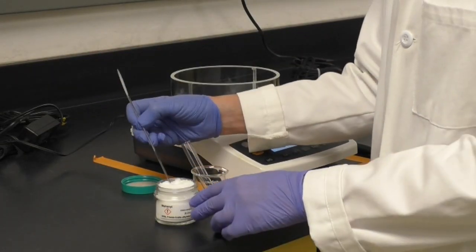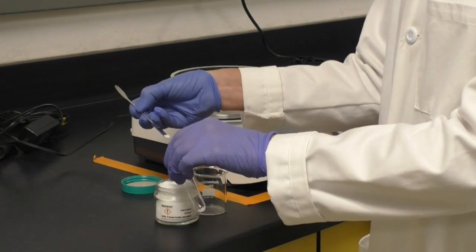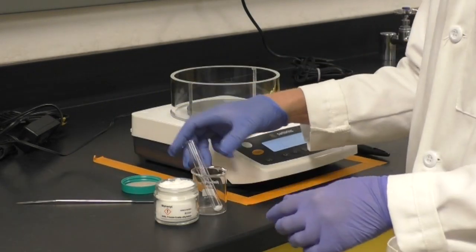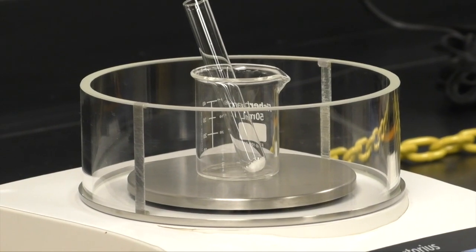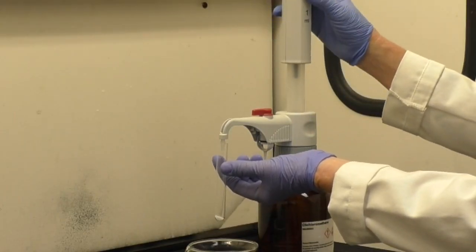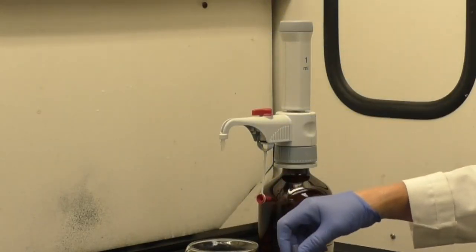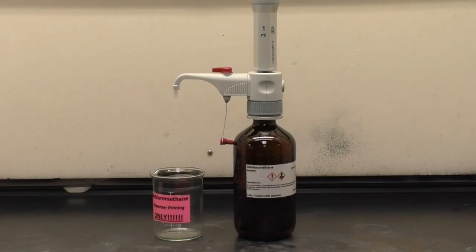Next, add 0.16 grams of biphenyl to the test tube. Then add 1 milliliter of dichloromethane using the 1 milliliter pump.